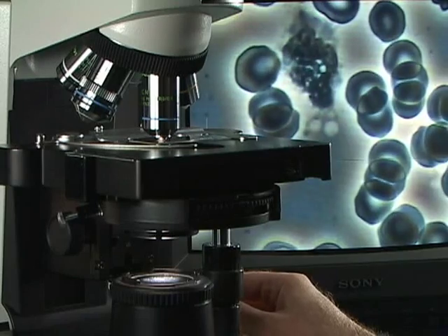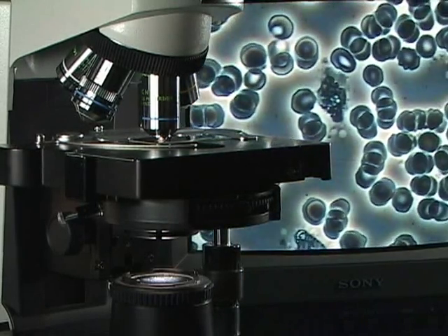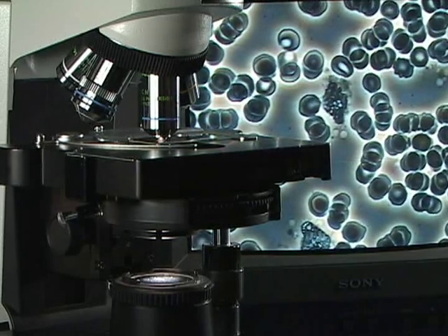But sometimes we might want a little more magnification and we might want some more resolution. In that case, we would go to an oil objective.